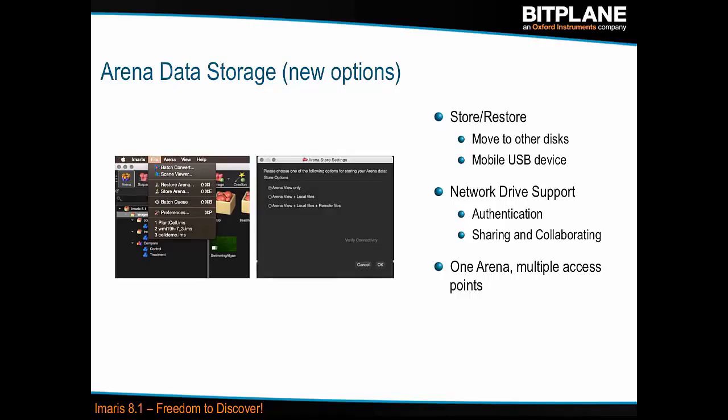The data will be on the network in a folder, and you can see what's in this folder. But if it's an Imaris file with Imaris analysis on it, they will need Imaris to open it, because if they calculated spots or filaments and created a vantage plot, at the moment Fiji does not open that information because it's Imaris specific. Like Imaris will not open analysis created in MATLAB, not all of it, unless you actually code it yourself. It won't automatically open it, or even Fiji.